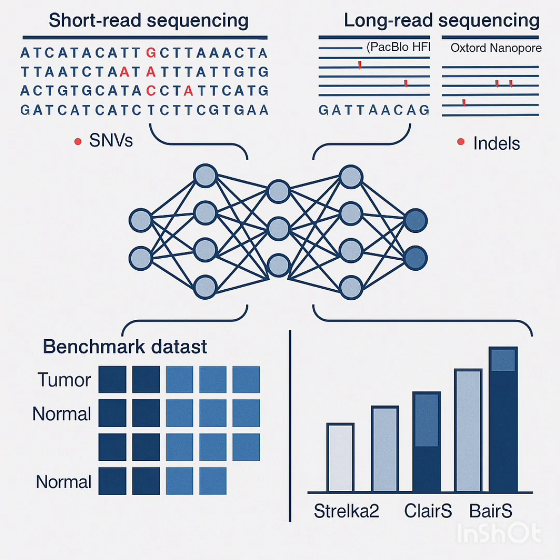Today we are taking a really close look, plunging right into the tiny details of cancer genomics. We're hunting for those really small but super impactful genetic fingerprints, the somatic variants, things like SNVs, single nucleotide variants, and indels, insertions, deletions. These are the key changes, the mutations that actually drive cancer development. And finding them accurately is absolutely critical for precision oncology.